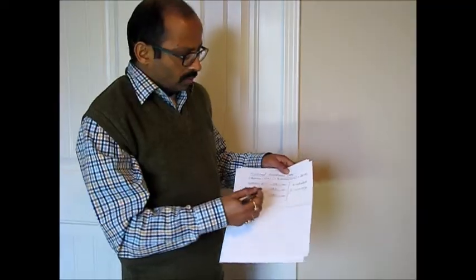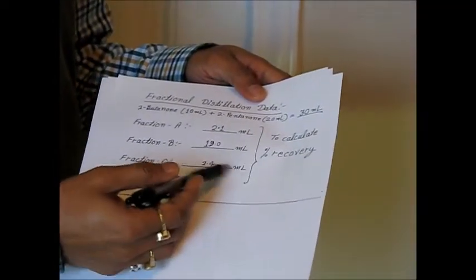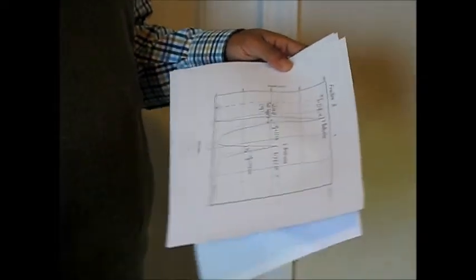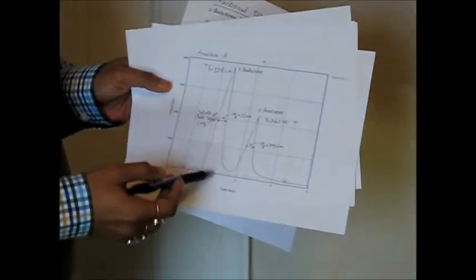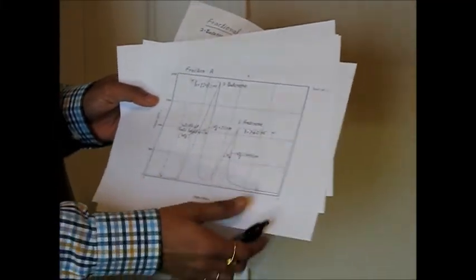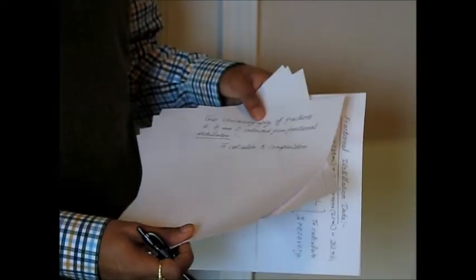So this was our second part of fractional distillation portion where we got the data. So to calculate the percentage recovery we know that the initial volume which was 30 mL and we got the fraction A and B and C how many volume we got. So use this data to calculate the percentage recovery and then we analyze each data through GC spectra and I calculated the height and width at half height for each peak and using these spectra you will calculate the percentage composition of each peak. So do this with yourself or with your instructor and thank you.